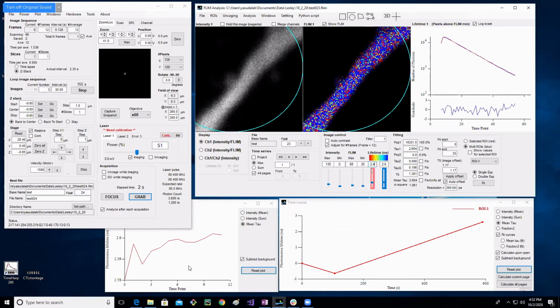So you can change this, and you'll see now my image is much more red if I change it to a smaller value. When you're analyzing specific data, you'll have to play around to see what range allows you to show the change that your data is showing you. This filter is another thing that we sometimes use for images. It just smooths out the lifetime variability.